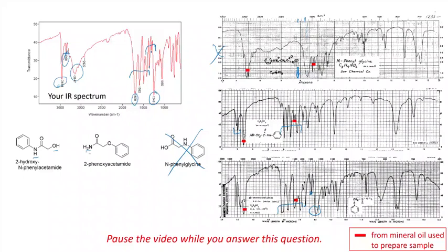In fact, if this is our peak that we're calling 1248, there really is nothing in this second spectrum at that point. Okay, so after this peak, we have a set of sort of medium peaks following that, and then a taller peak here. And this looks kind of like that. And, you know, there's not much up here, is there? Okay, so it's looking good for number 3.